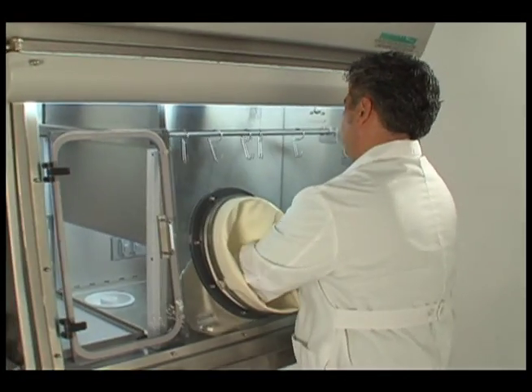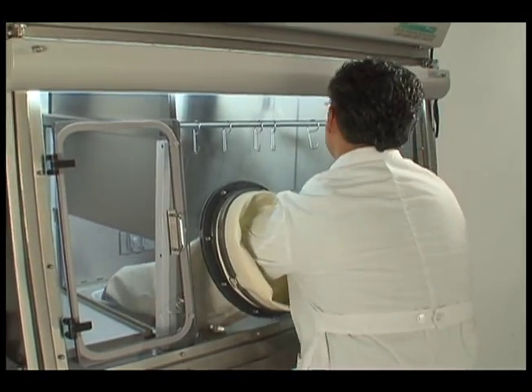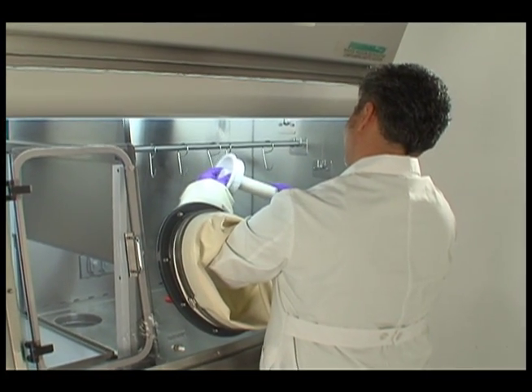Finally, screw the post back into the waste chute cover and put it back into place.